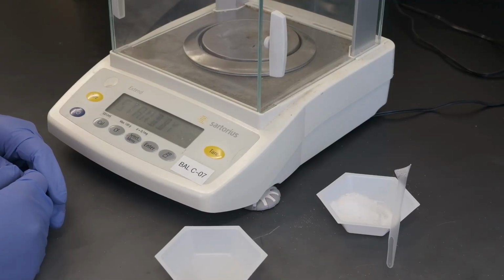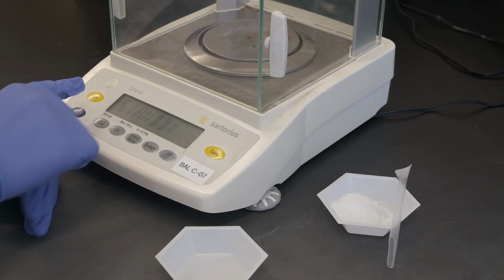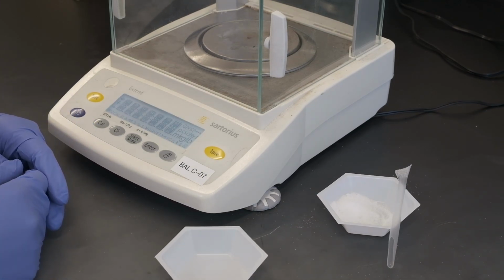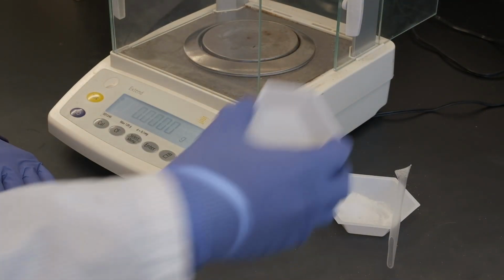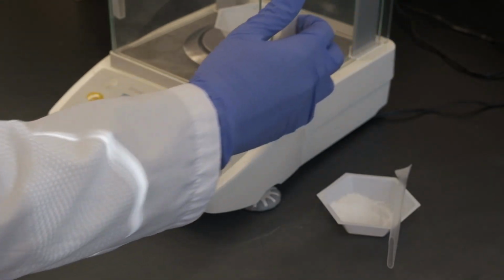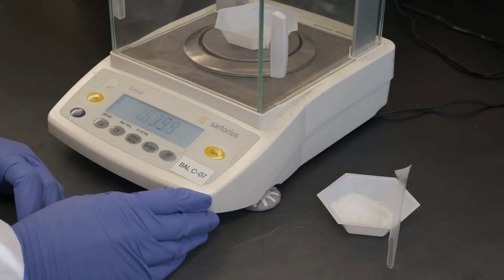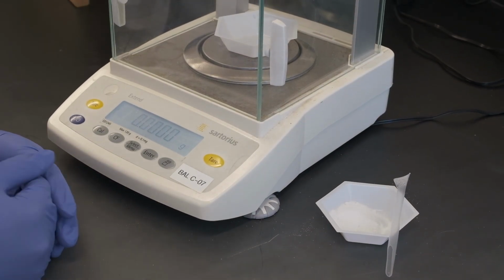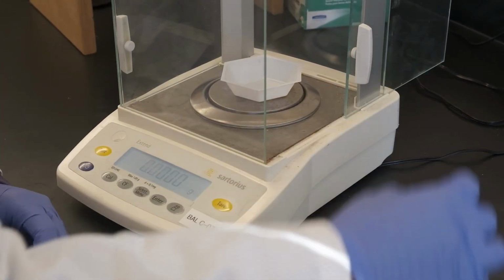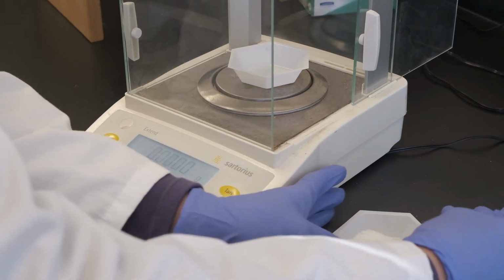So what we're going to do is measure approximately 3.2 grams of the oxalic acid. Using the analytical balance, we're going to turn it on. Then we're going to place our weighing boat inside and tare it. Using the spatula, we're going to add our oxalic acid.